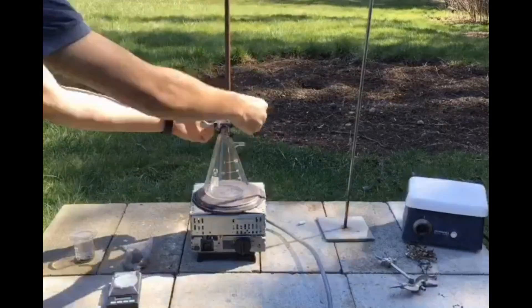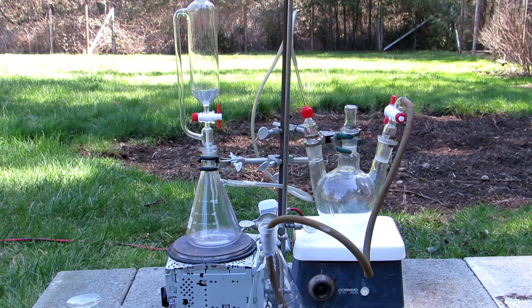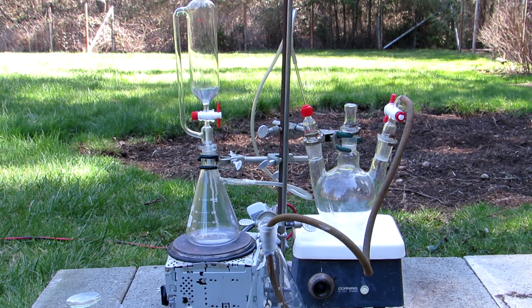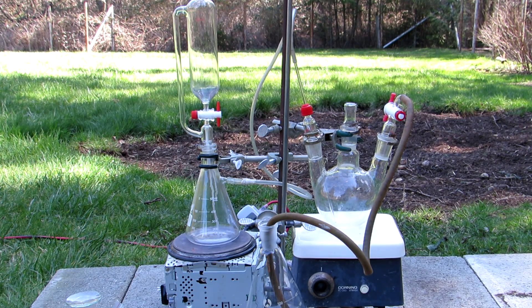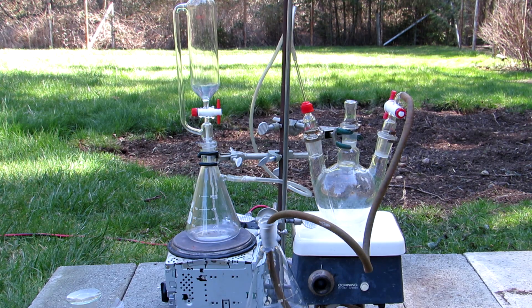Once no more sulfur dioxide is evolved, the iron sulfide was left to cool and an apparatus was assembled. We will be reacting the iron sulfide with hydrochloric acid to produce hydrogen sulfide gas, so to control the gas generation, a pressure equalizing addition funnel was set up on an Erlenmeyer flask. A three-neck round bottom flask with a gas tube entering one arm was then connected to the hydrogen sulfide generator. The outlet tube was directed into another Erlenmeyer flask with a baking soda solution to neutralize any hydrogen sulfide that makes it through.